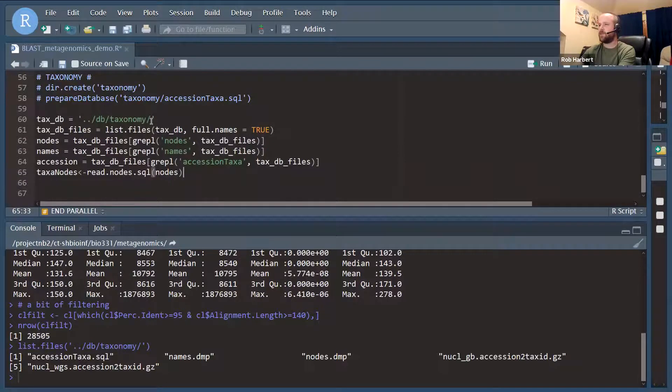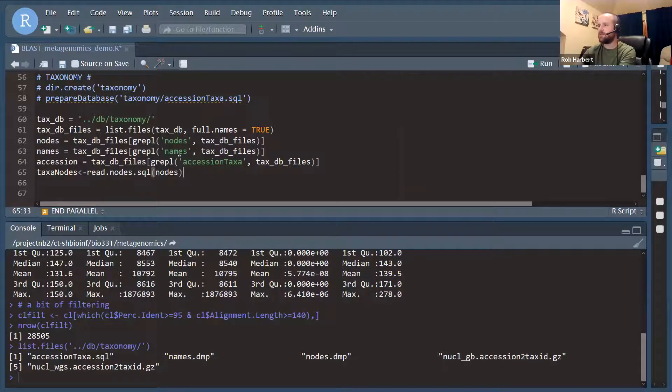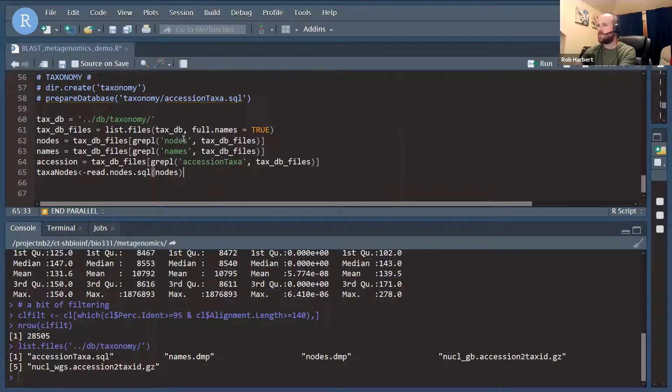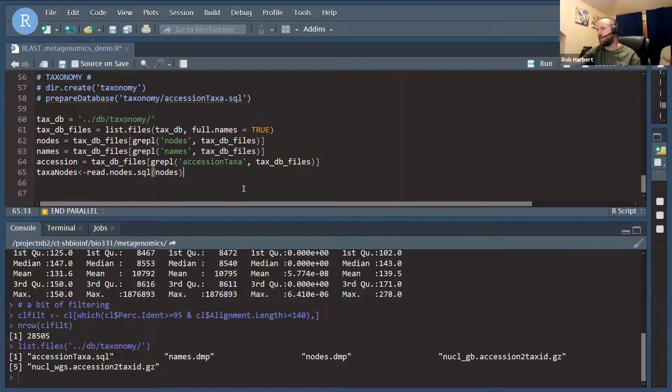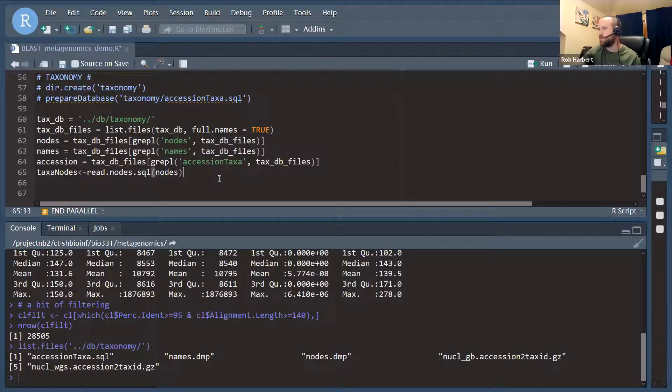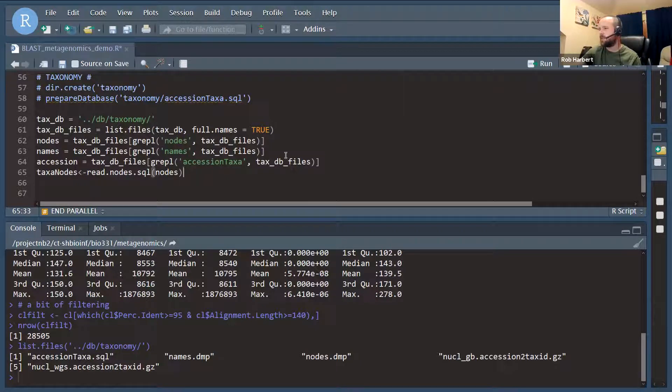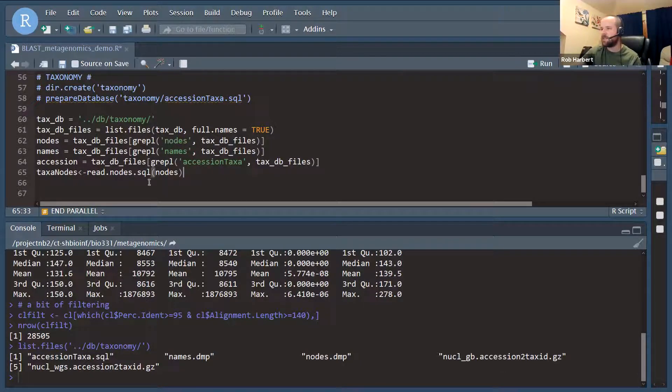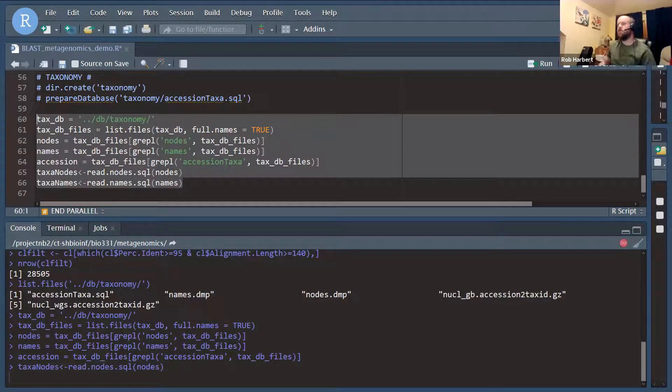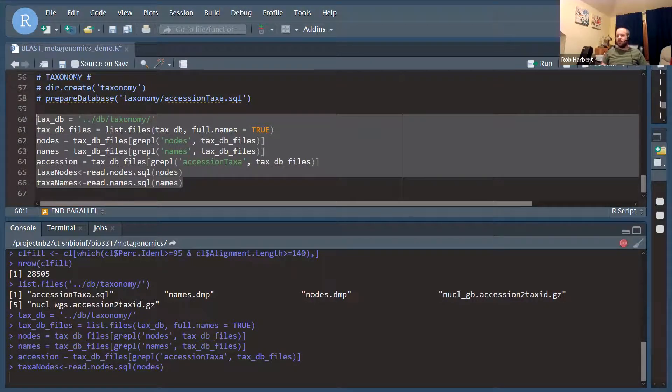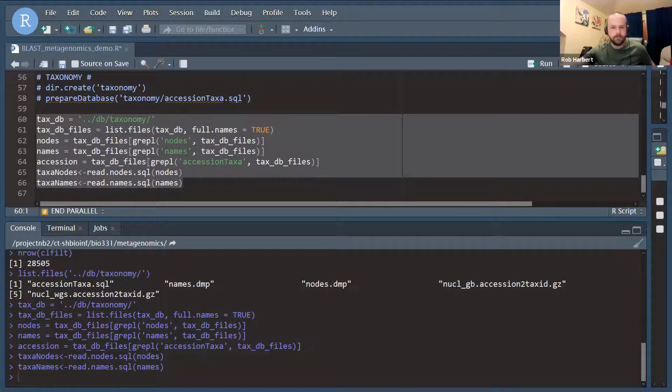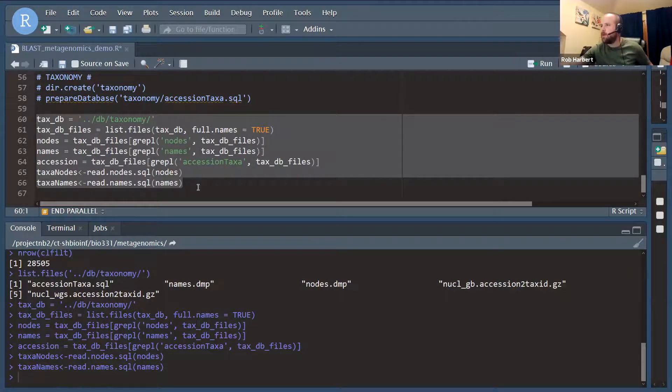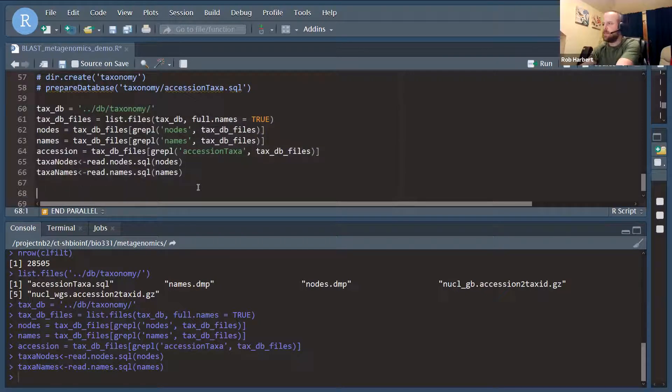We run that and we've got our SQL files that were set up by running that prepare database function earlier. So we're just going to refer to that location here when we want to find our taxonomy. First off, we're going to list the files in that taxonomy folder. We're going to identify the one that starts with nodes, one that starts with names, and one that starts with accession taxa. The nodes and the names contain information about the hierarchical taxonomy. The accession taxa database will let us look up individual accession ID numbers and associated taxon ID numbers. And those taxon ID numbers refer to places within the nodes and names database. And this will take another couple minutes to load the databases. But once databases are loaded, this is very quick.